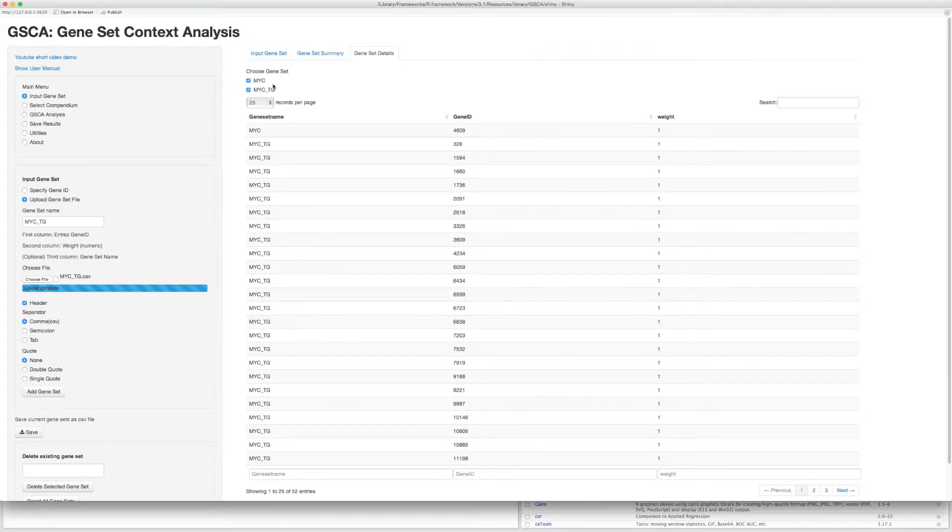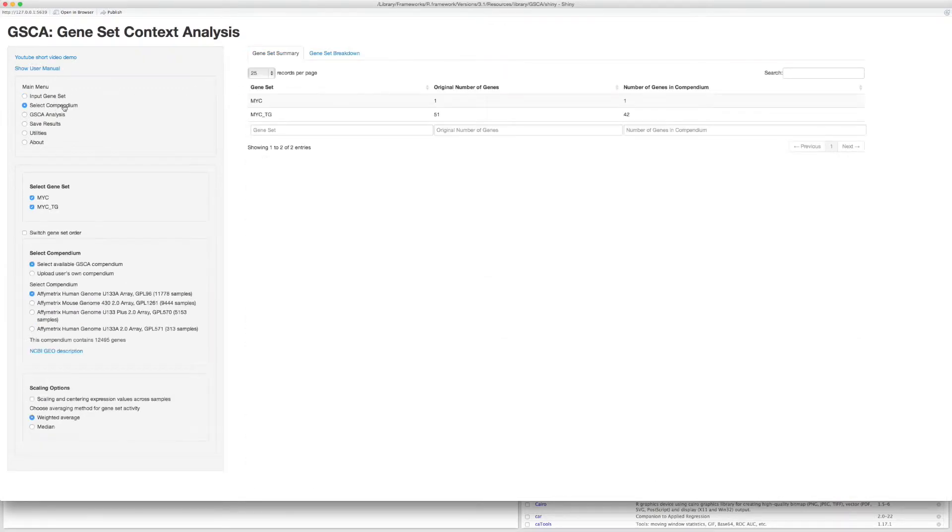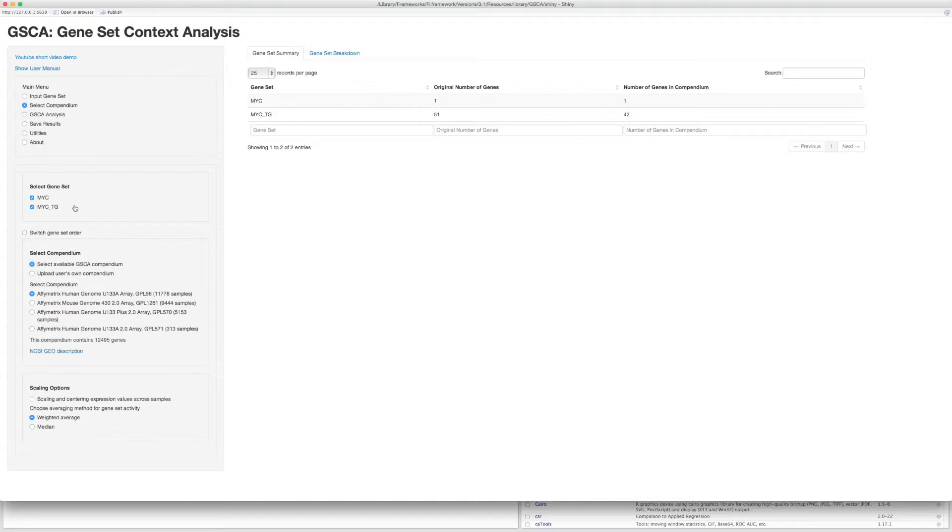Now let's go to the second step to select Gene Set and Compendium. If you have imported lots of gene sets in the first step, you can select what gene sets to be included in GSCA analysis here. There are currently four compendia available for GSCA analysis.